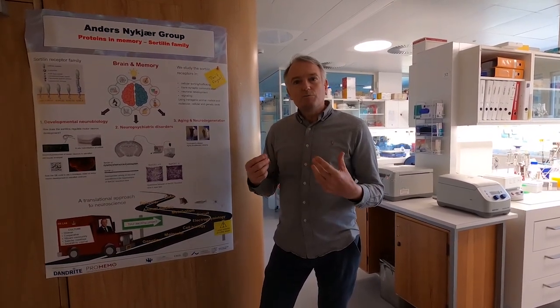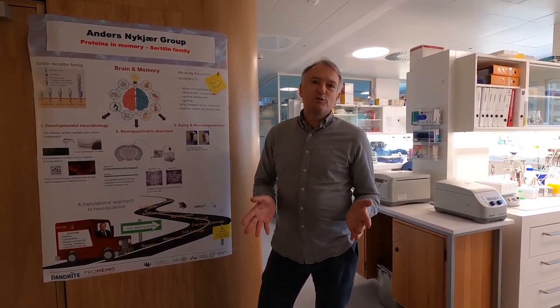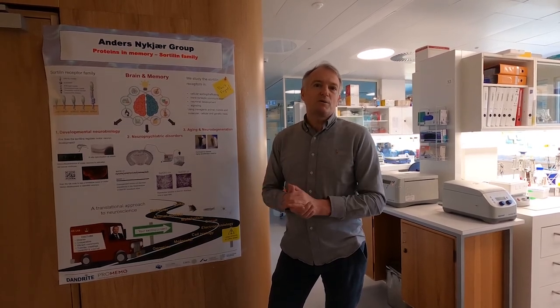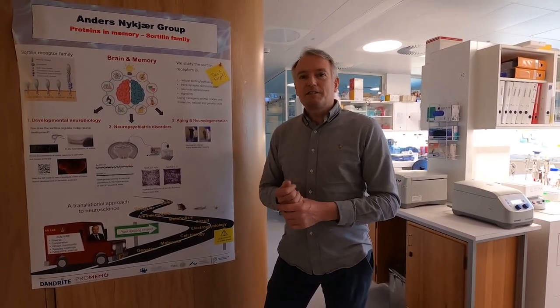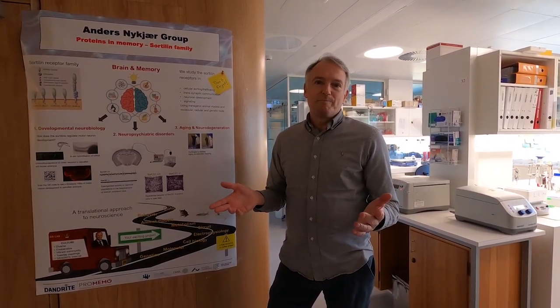And we are trying to now rule out what the receptors are doing at various levels, from the molecule to the cell and to the integrated organism, like mouse and zebrafish, and also combine it with human genetics conducted by some of our colleagues. In particular, we use a large combination of methods, like engineered zebrafish and mice, electrophysiology, cell biology, advanced imaging, omics, and behavioral studies.